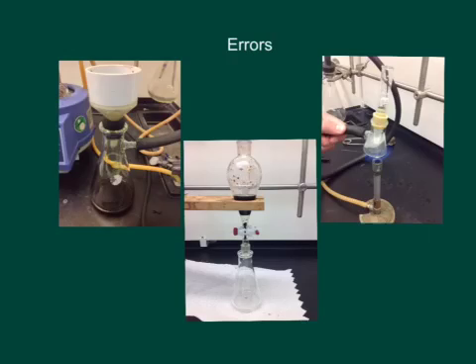In this experiment, there were errors that were unavoidable or technical in their procedure. For example, the extraction procedure, in which methylene chloride was used 5 times to extract the caffeine to the utmost level from the liquid above, could have caused problems. As you can see from this example right here, the student didn't efficiently extract the liquid and had some of the layer inside the methylene chloride when extracting. This could have caused problems later on when purifying the caffeine.